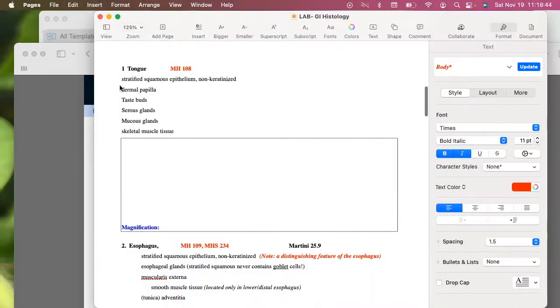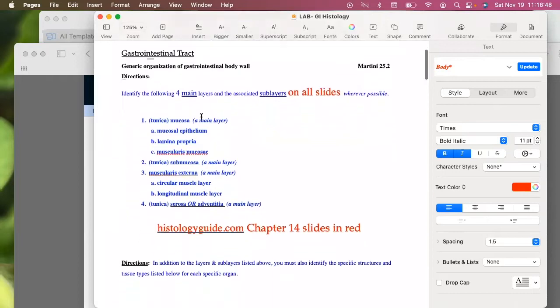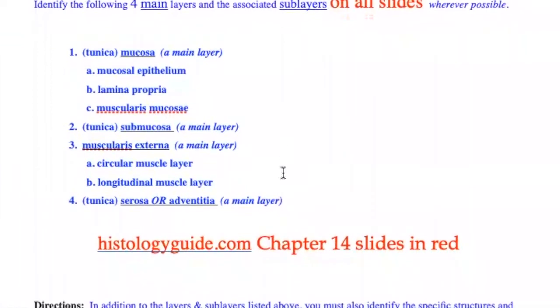Again, we're going to go through this histology one again. For any particular layer, I may ask any of these. Again, I'll try to make it the most clear examples, right? Not do something obscure, because some of them are not so easy to tell.